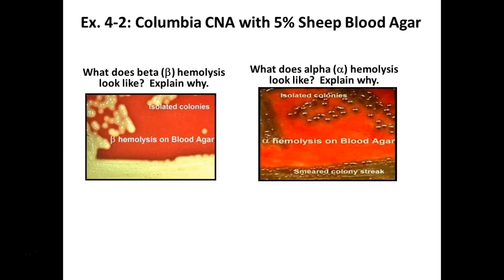Yours would be called gamma. It just grew. It didn't change the red blood cells at all. Yeah, so actually, pass around y'all's plate. So guys, this is a good example of gamma. It just grew, didn't do anything to the red blood cells.